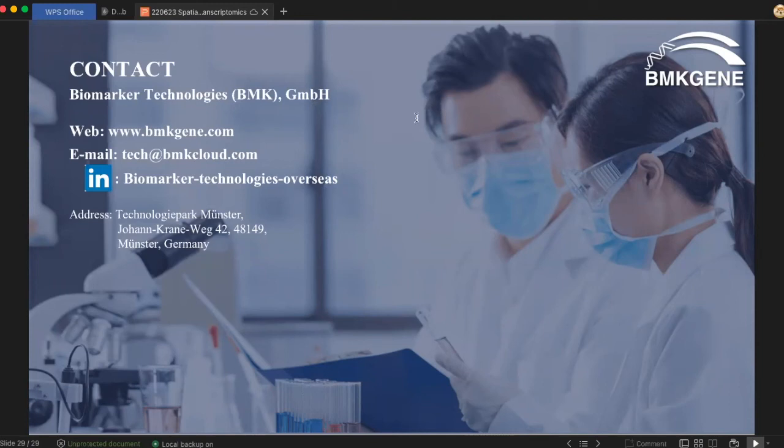One question from Anna: on which plant tissues has this type of analysis already been applied, only leaves or roots? In most of our plant projects, we have done leaves, but leaves are sometimes limited by the thickness of the tissue. We have also done some roots, but fresh roots, like the tip of the roots, are more preferable in this plant experiment.